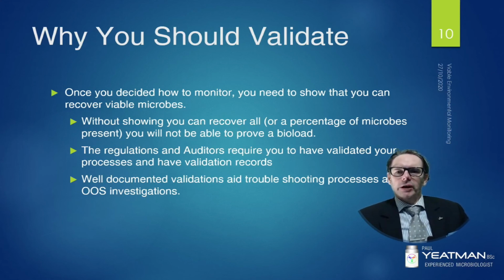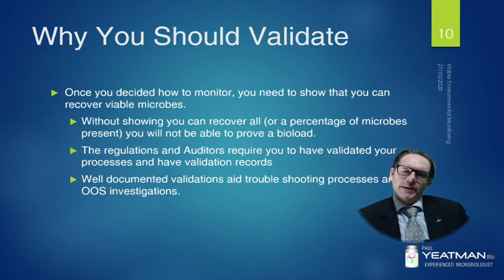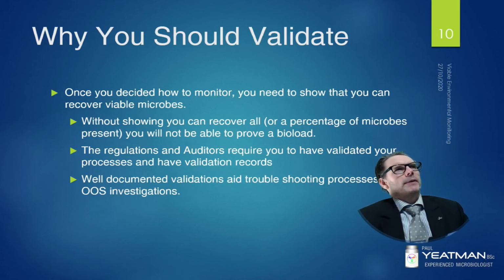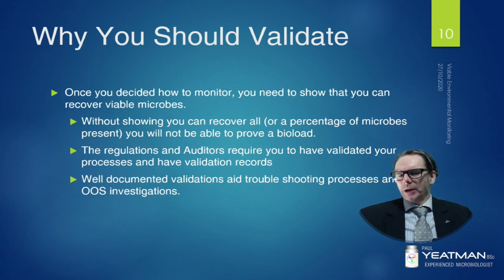When I validated the Merck MAS 100 air sampler, at low levels of recovery, a 1-to-1 recovery was shown to be possible by testing serial dilutions on the agar plate to be used for microbial recovery. We didn't actually test the physical recovery because we would have to aspirate the air with microbes. So what we did here was rely on the conversion tables provided by the manufacturer, which showed that I think 90 or 100 CFU would be able to be sampled fine. When the number of microbes goes up, the chance of a microbe actually impacting the sampling head rather than going through one of the holes in the sampling head increases. So the recoveries would go down, but only at high numbers.